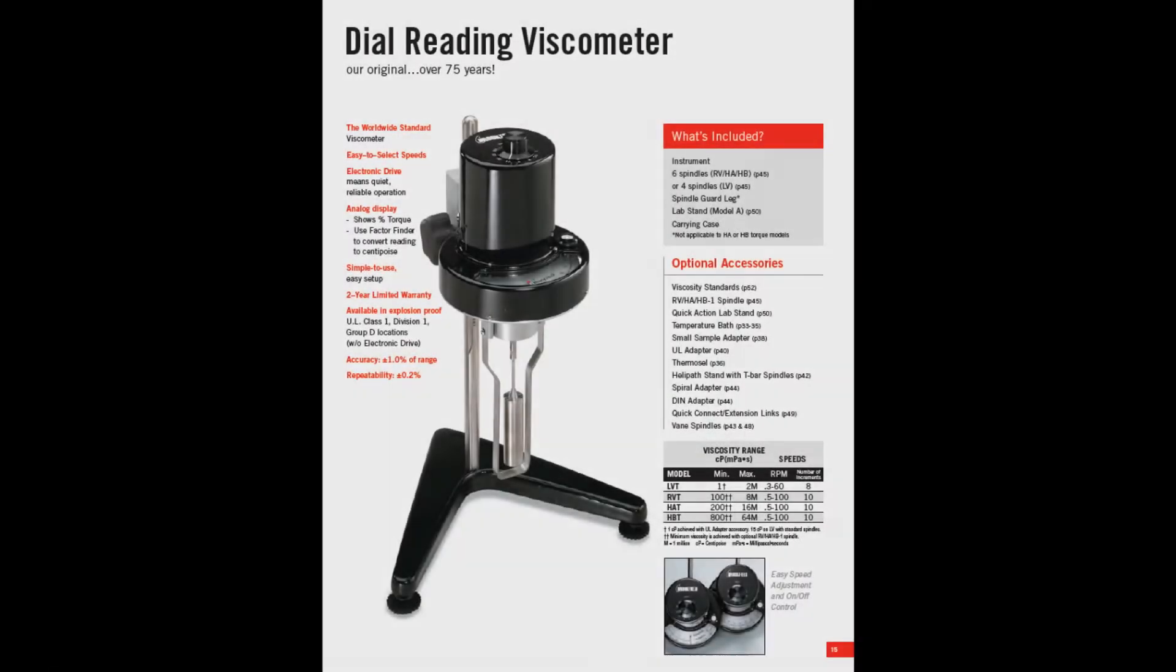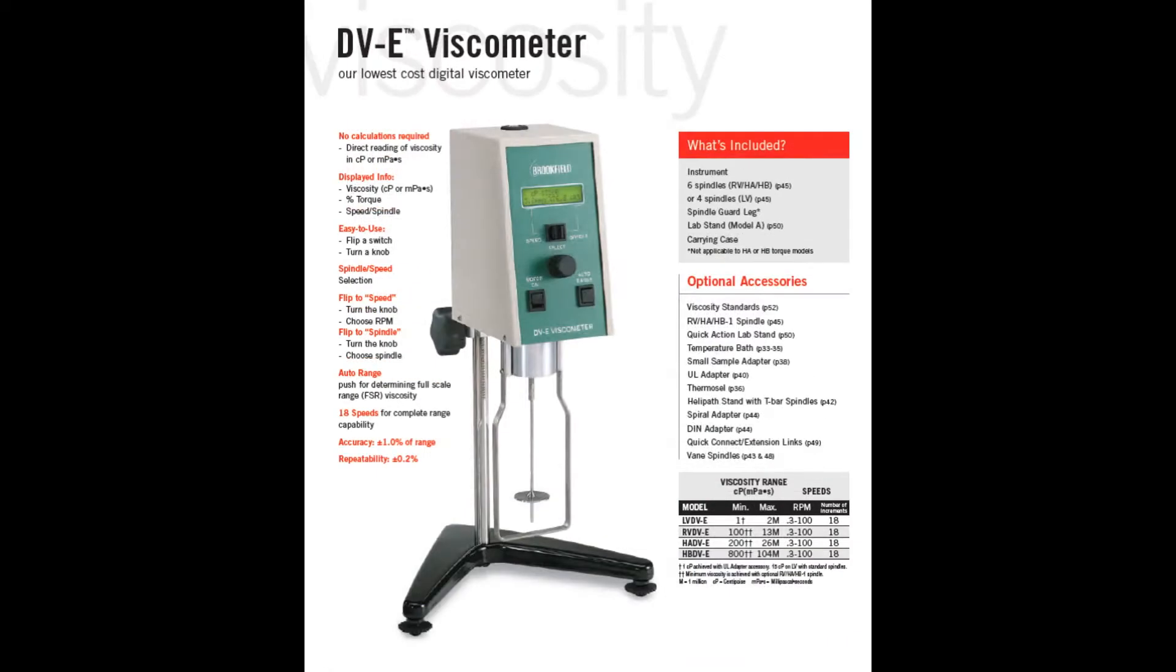For units that do not AutoZero, such as the dial reading and DVE model viscometers, the unit must be leveled prior to performing tests.